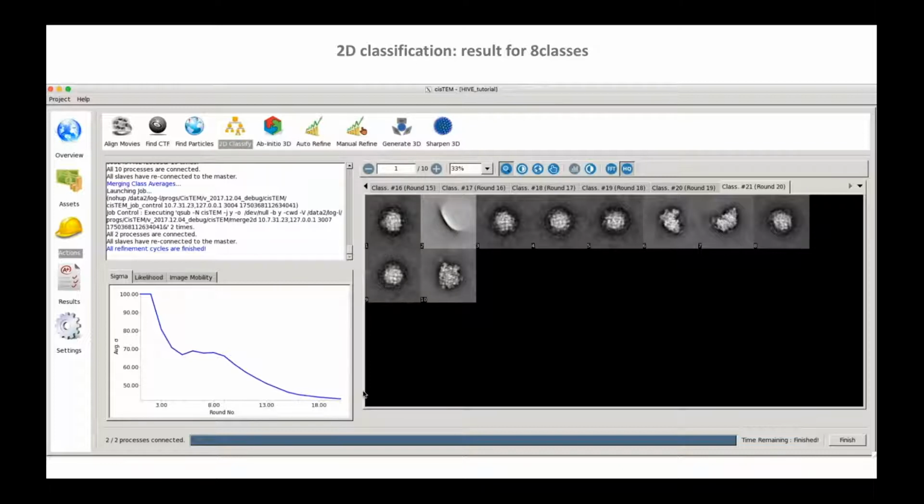So you don't set some kind of arbitrary cutoff to bin them? When you say arbitrary cutoff, you mean the number of classes, of course, right? So the arbitrary cutoff we usually use is 100 classes. Okay, got it. Yeah, that's simple, and it usually works. But depending on the number of unique orientations, is there an inherent disadvantage to having redundant classes? Yeah, exactly. It ends up getting bigger. So yes, there is.